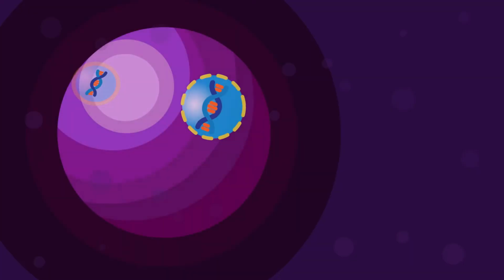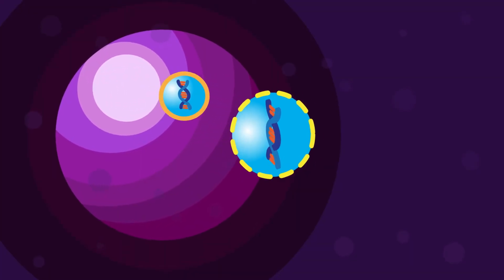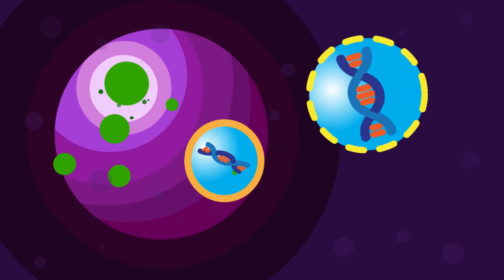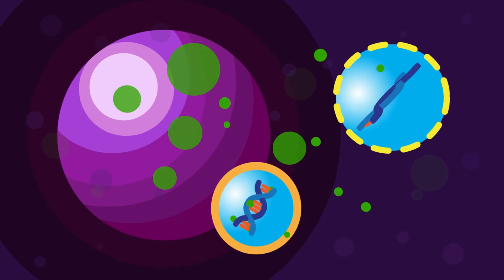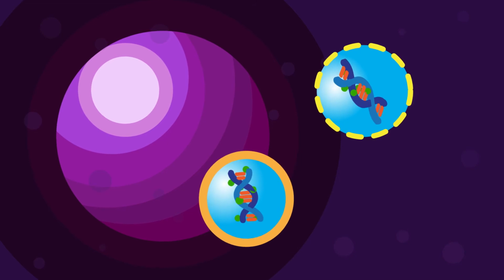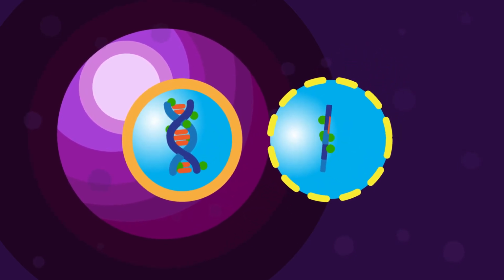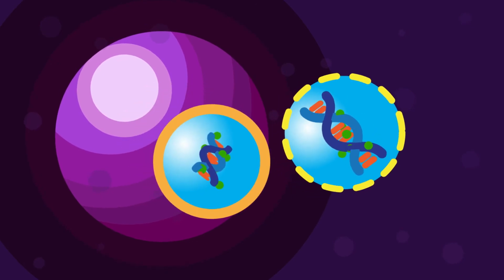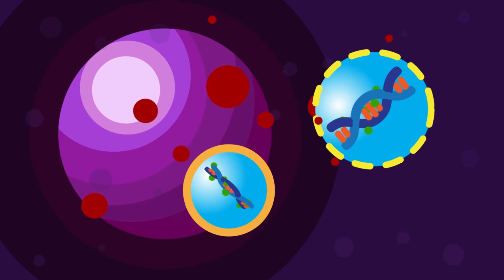The principle that flow cytometry applies to quantify bacteria is by a membrane-permeable dye called SYBR green. SYBR green can enter both live and dead bacteria and label the bacterial DNA. Flow cytometry reports the amount of detected SYBR green as the total cell count. To quantify dead bacteria, another dye called propidium iodide red is used.